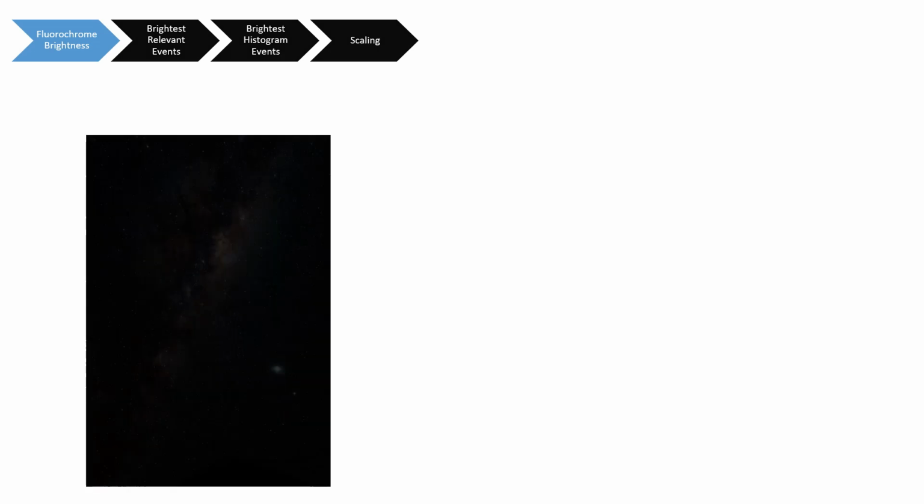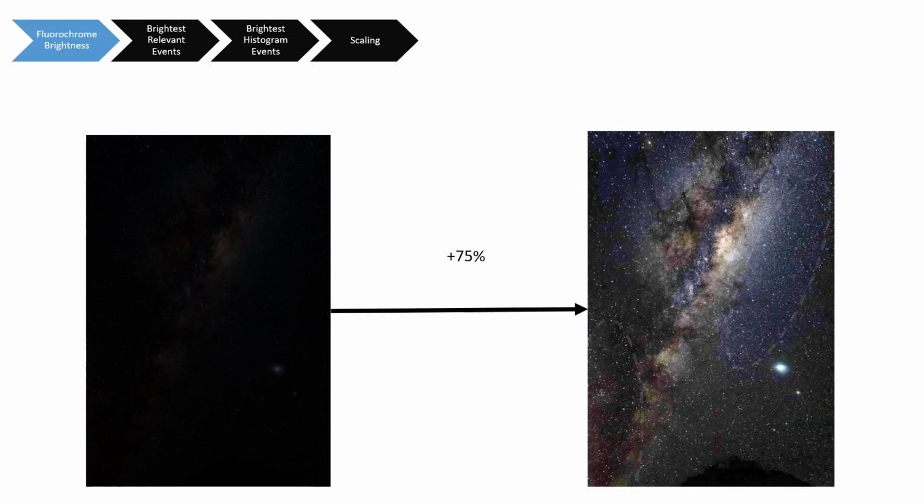However, it is challenging for software to estimate what a brighter signal will look like when using a dim reference. If you have a really dim shot and attempt to brighten it, you will get artifacts, as in this example, where the colours have been artificially enhanced. In cytometry, the software doesn't even attempt to predict. Instead, best case scenario, you will see undercompensation for the fluorochrome in spectra that emit in similar areas, as more photons are associated with that signature than the software is expecting.